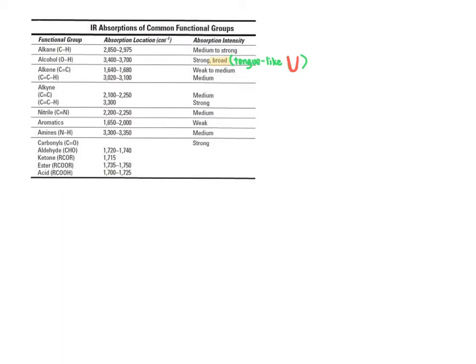That's what you're going to be looking for when looking for an alcohol group. Keep in mind that other groups, specifically alkanes, can show up kind of close in region around 3000. Alcohols are a little bit further at larger inverse centimeter values. Alkene groups also show up in that same region, but they're not going to appear as that tongue-like shape.